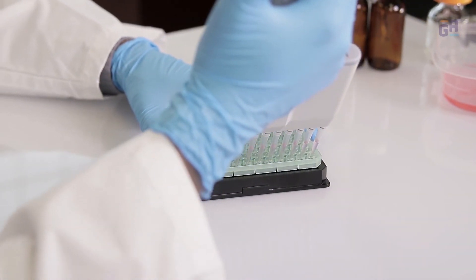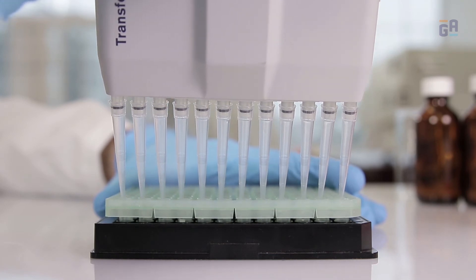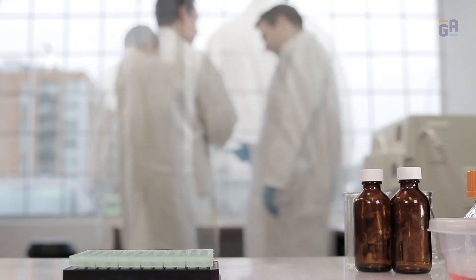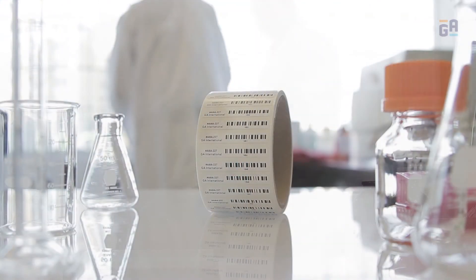From biobanks and biostorage facilities to IVF labs, contact us today to see how GA can help you with your cryogenic storage identification needs.